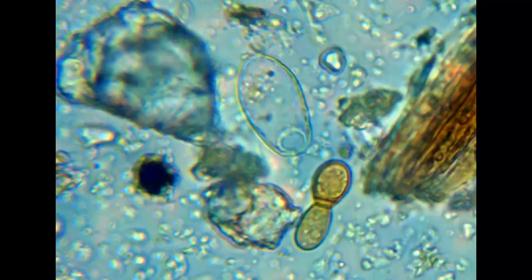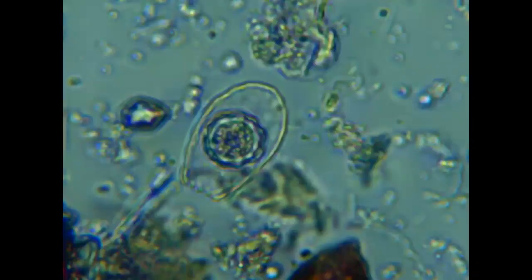For some reason, New Mexico and Arizona have very few flagellates or naked amoeba — it's almost always the testate amoeba. My guess is that the shell helps them survive in drought conditions. When any of these organisms go into stasis, they form what looks like a double-ringed sphere. If you see these under the microscope, that usually means they're in stasis — hibernating. They could come back, or they might not, depending on conditions.